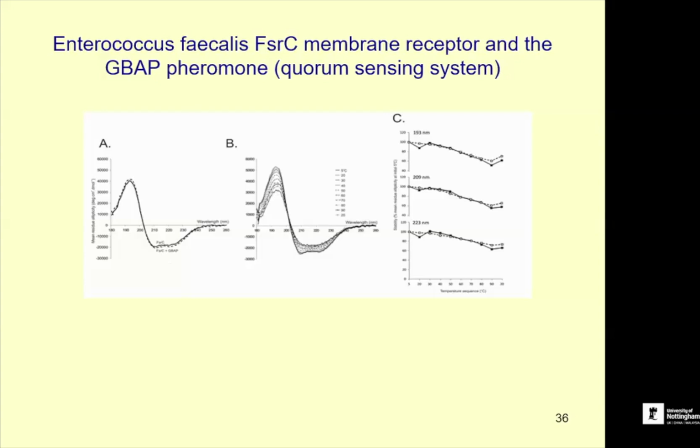So if they had any doubts about whether they can see the interaction, because as I've mentioned, you don't always see it if it doesn't affect the aromatics, for example. The best rule of thumb is to use more than one biophysical technique to demonstrate an interaction. So you might turn to AUC or ITC that I mentioned as well, as that's the best way to tackle it, to be 100% sure by using more than one biophysical method.